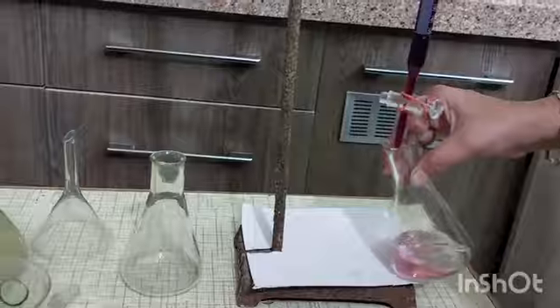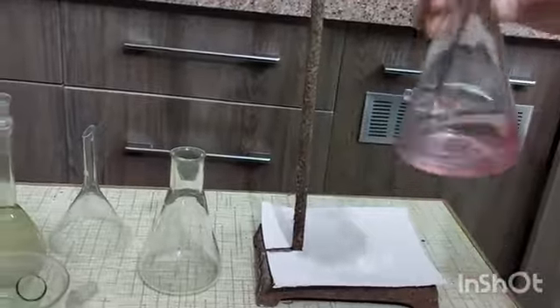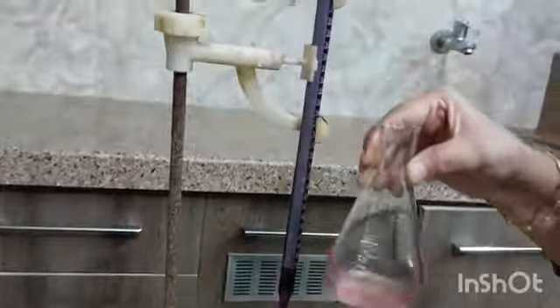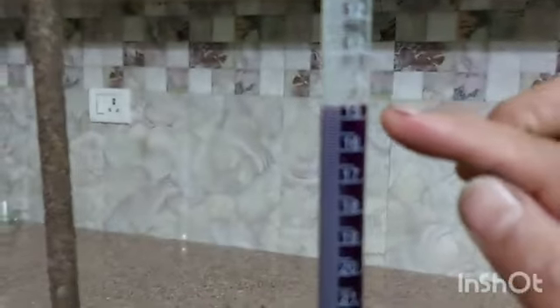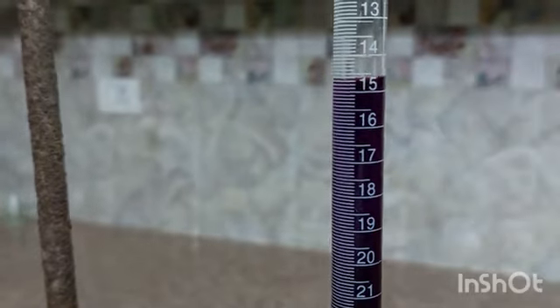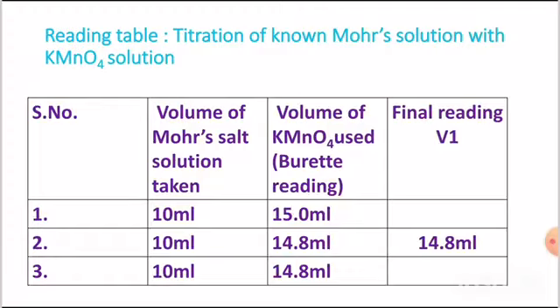Note the reading, that is 15.0. Repeat the procedure at least 2 times.